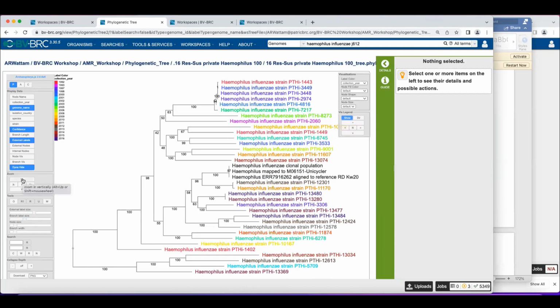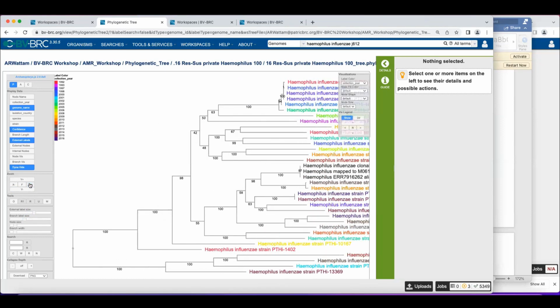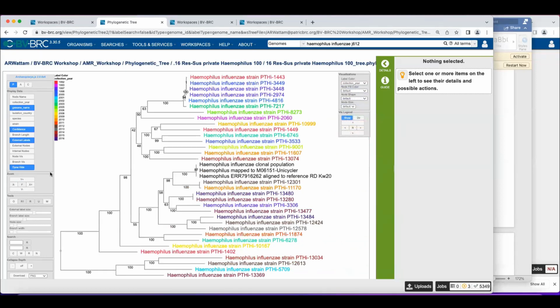There are controls to increase or shorten the y-axis, or increase or shorten the x-axis. Right now we limit it to 100 genomes to run the whole thing, but for the viral genomes there are a lot more. Generally, especially with the bacterial stuff, I'm always thinking about how this is going to look in a publication. If you have 100 genomes, often it's very hard to see that figure. So I generally like 20 to 40, which can be resolved well.